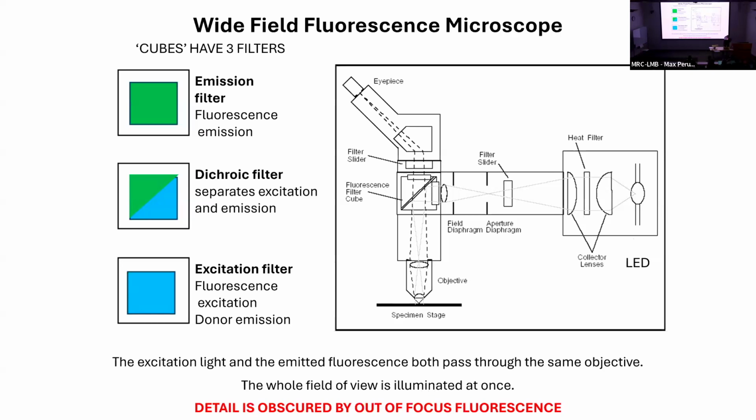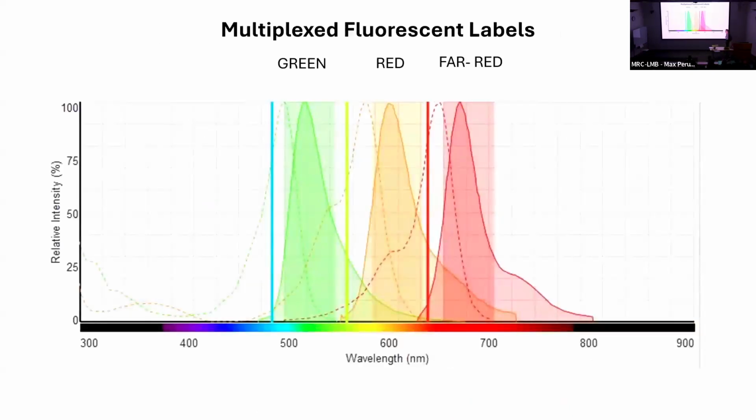And as Pier has amply introduced to us this idea of spectroscopic labeling and whatnot, we've got all these different fluorescent dyes, just like with flow, and you can multiplex. And so typically on most microscopes, we've got a blue channel, a green channel, a red channel, a far red channel, something like that. You can pretty much expect those. So that's really helpful. So very simple technology allows us to multiplex different things.